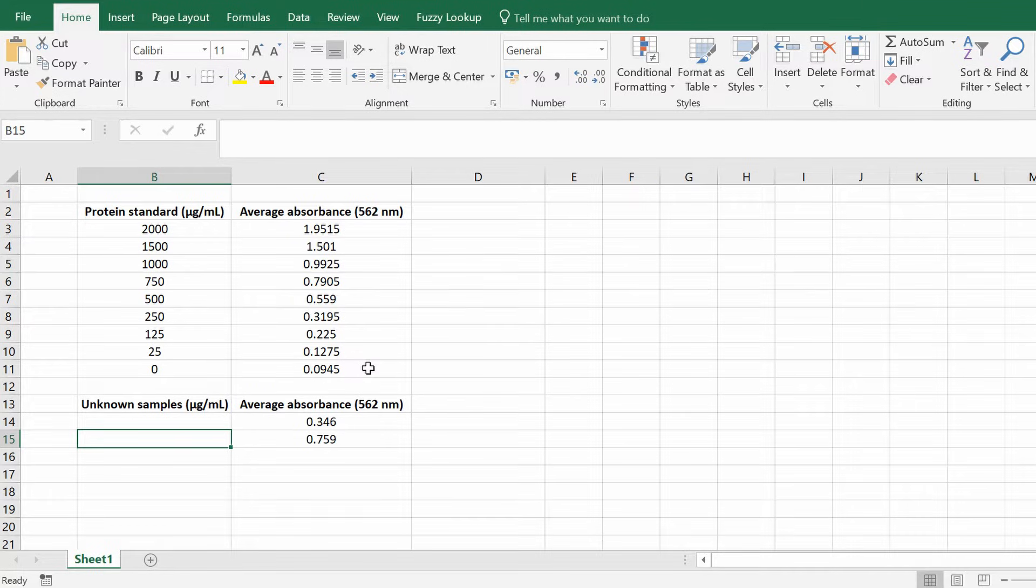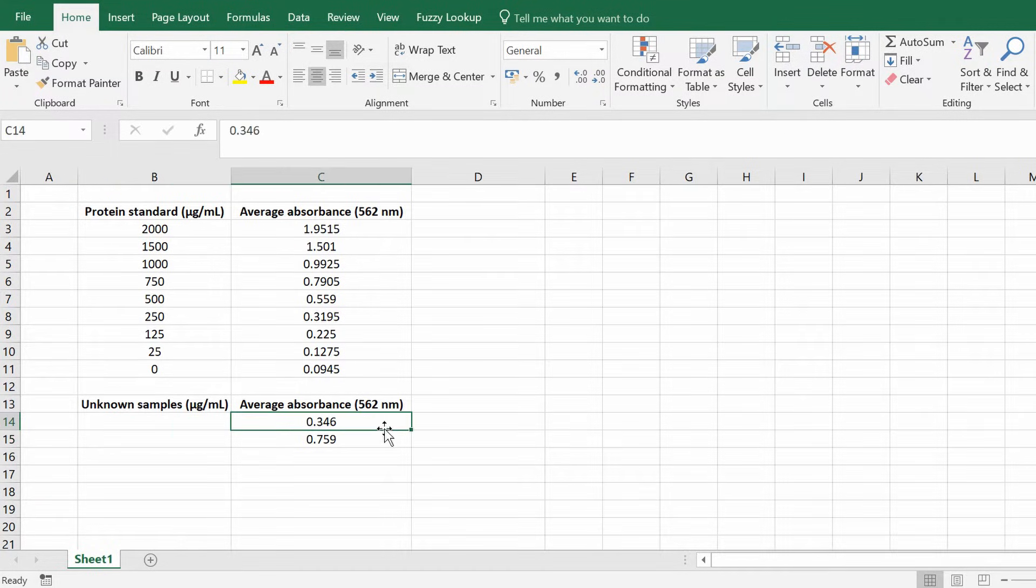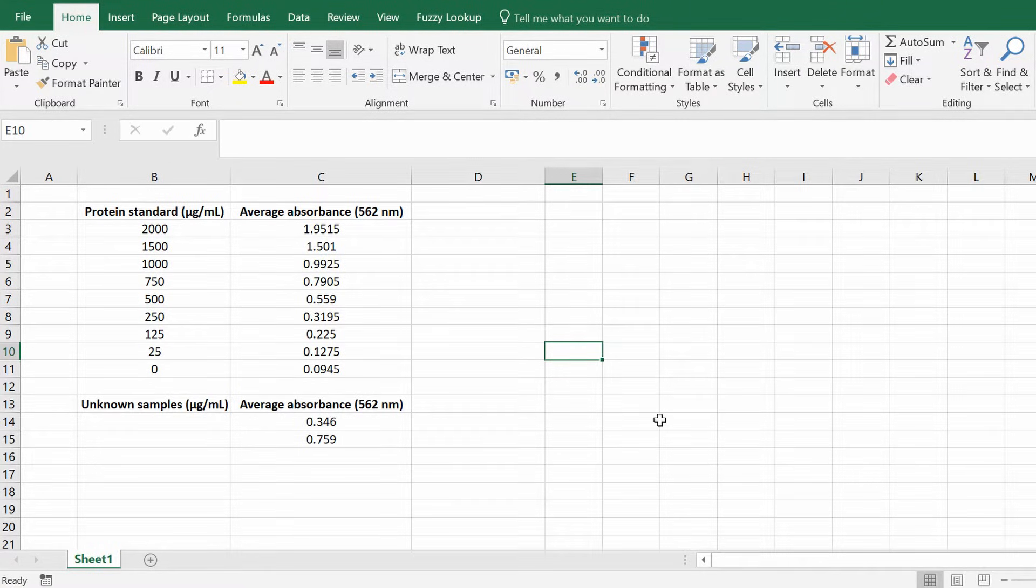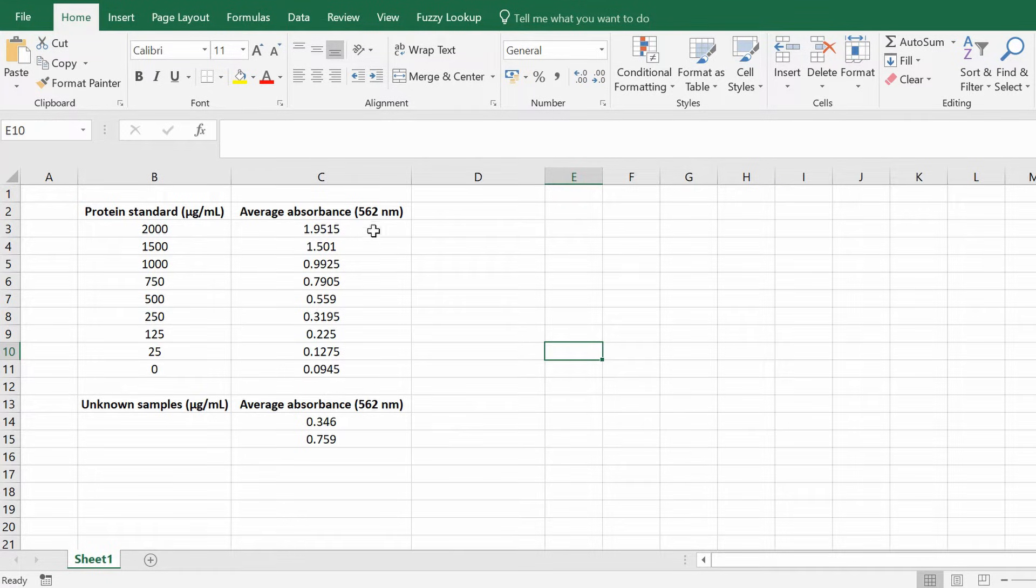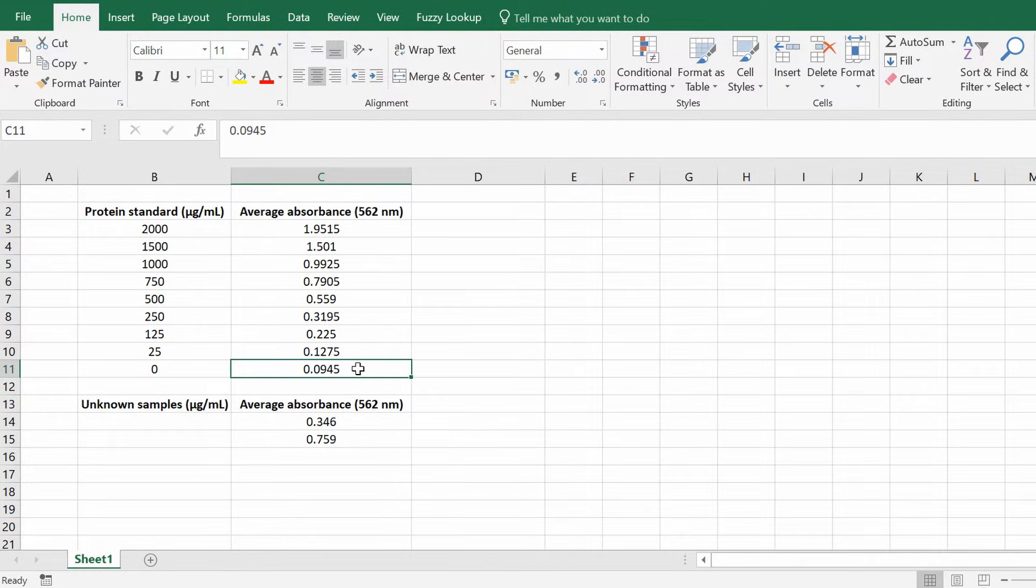Obviously my objective is to calculate what the concentrations of these samples are by using my standard curve. So I don't know this value and I've also got the absorbance values for these. So the very first thing you should do is to make a background corrected absorbance value. So what I mean by this is to take these average absorbance values and minus the background value. Because obviously you want to take into account that the background has some kind of signal.